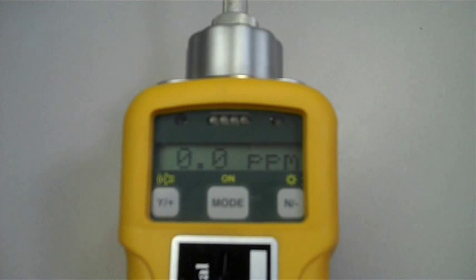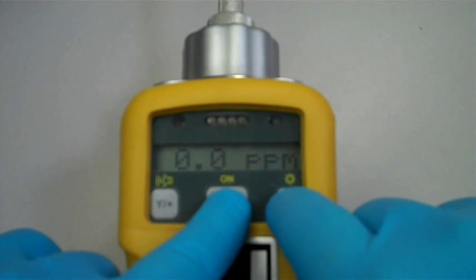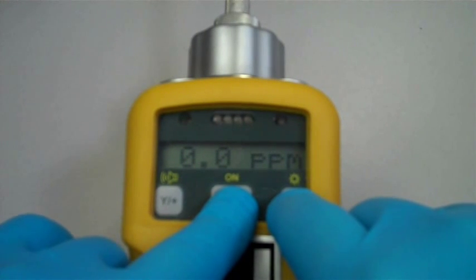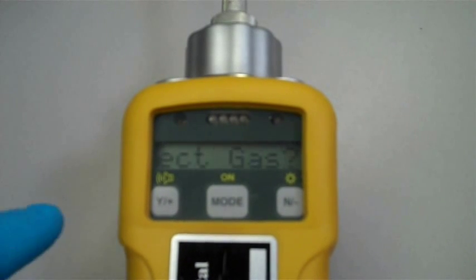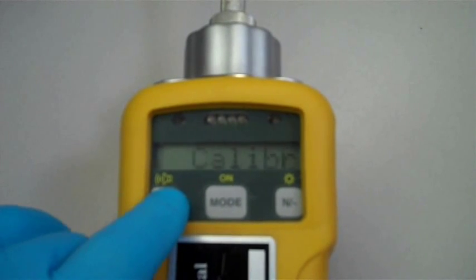To begin calibration, press and hold the Mode and N buttons together until the screen changes. The unit will now display the first setup menu for calibration. Press the Y button to access this menu.